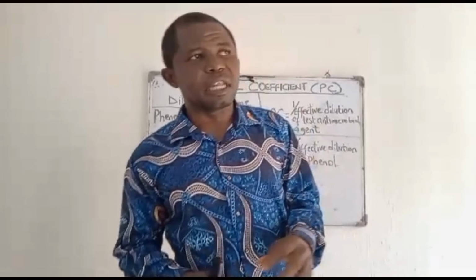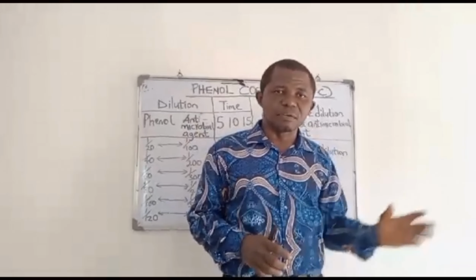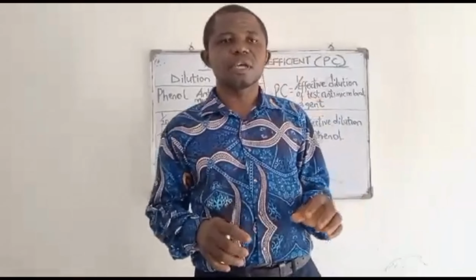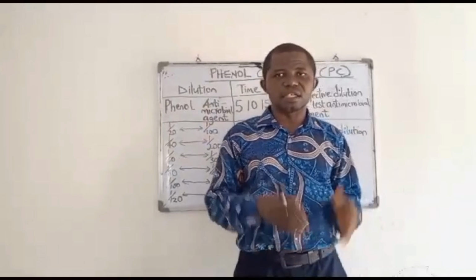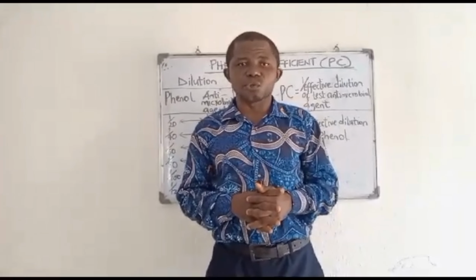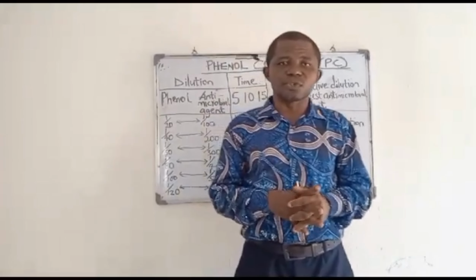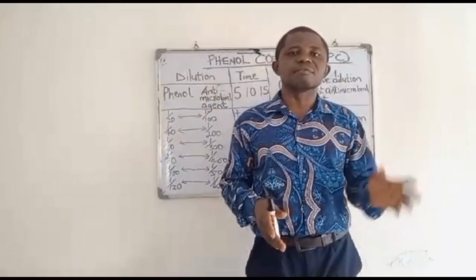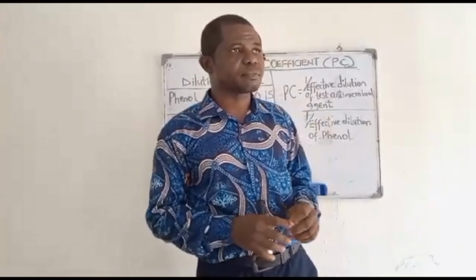The next, fresh viable organisms are inoculated into this series of diluted tubes and exposed for 15 minutes at 37 degrees centigrade.